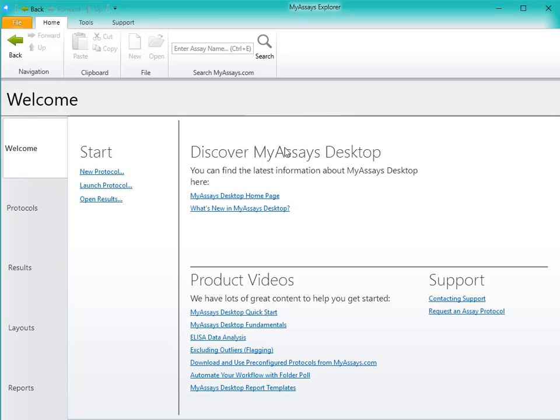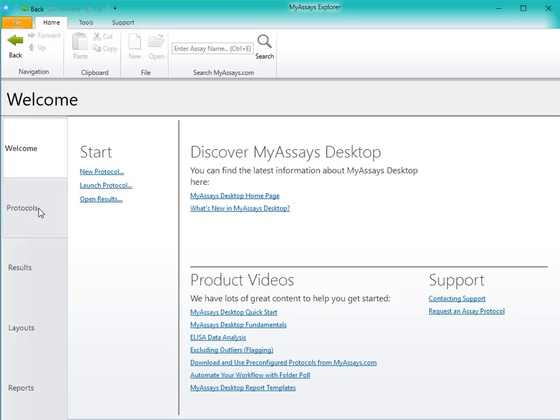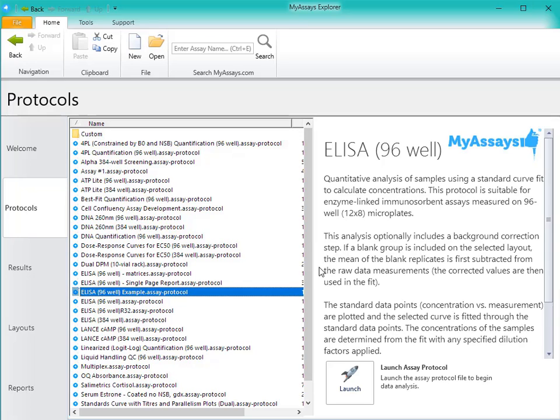In the MyAssays Desktop Explorer, I can open the Protocols tab and select the ELISA protocol. Once I've selected the protocol in the right-hand pane, I can see a description of the protocol. I can click Launch to open the protocol, or I can just double-click.